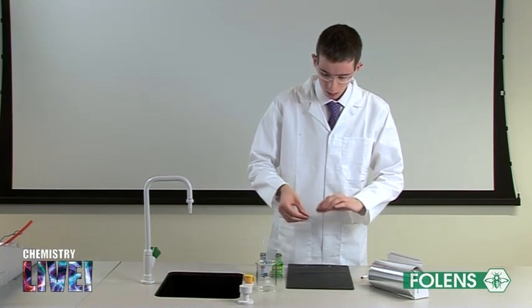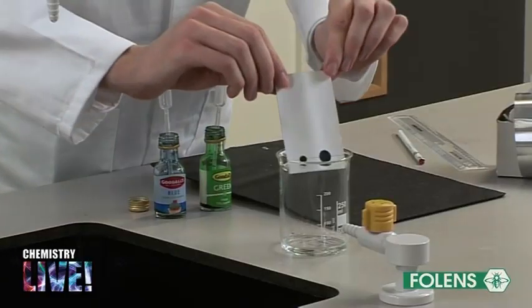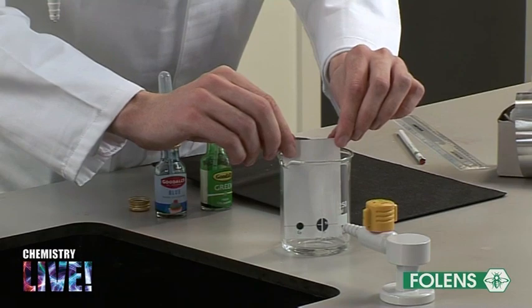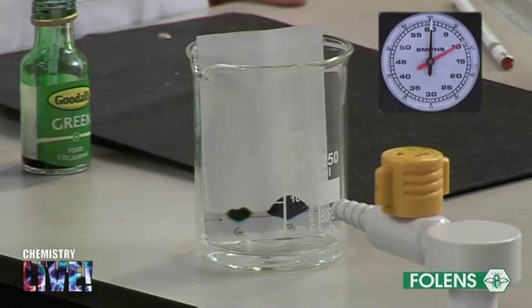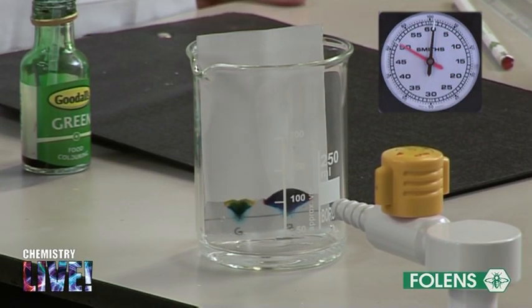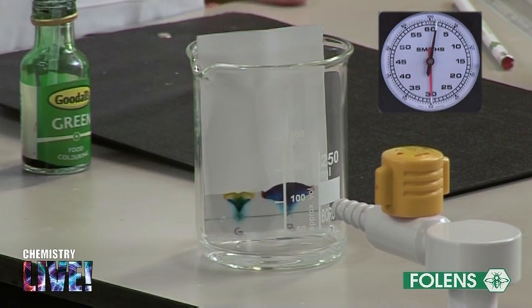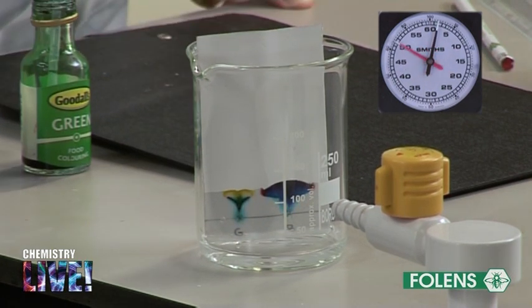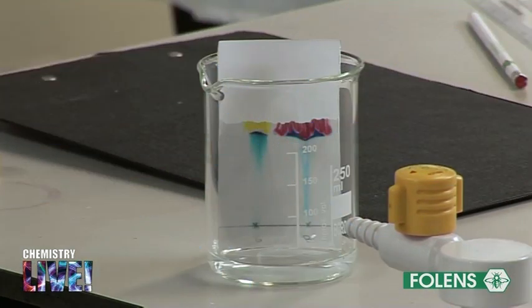Place the TLC plate in the beaker as shown. Allow time for the solvent to rise up through the plate until a separation of colors is observed. This completes the experiment.